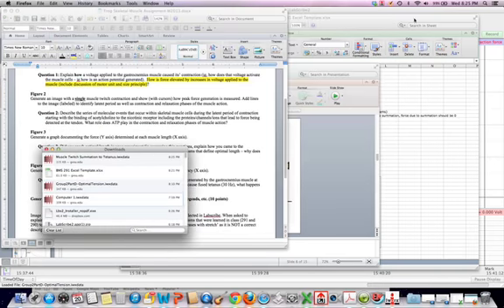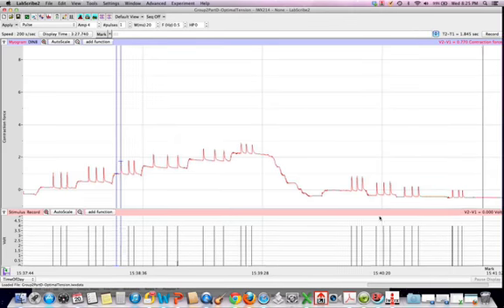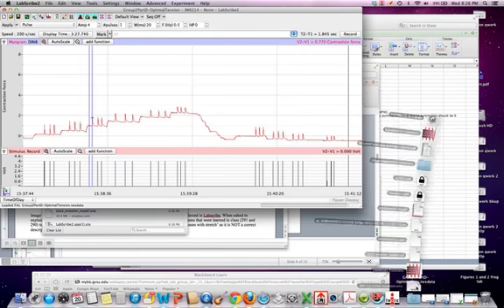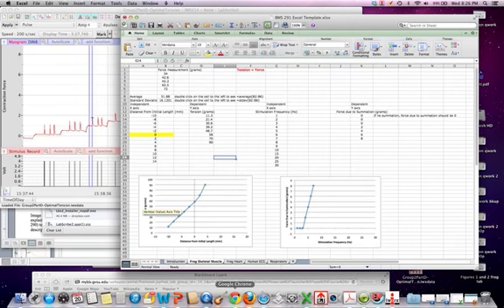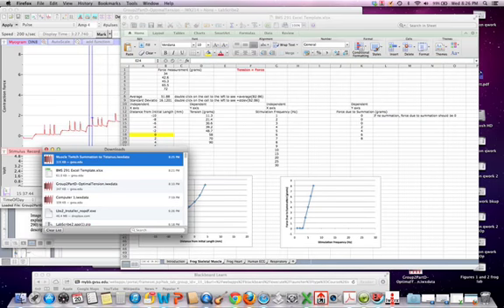This is a better way to do it. Try that one more time over here. There it is. All right.